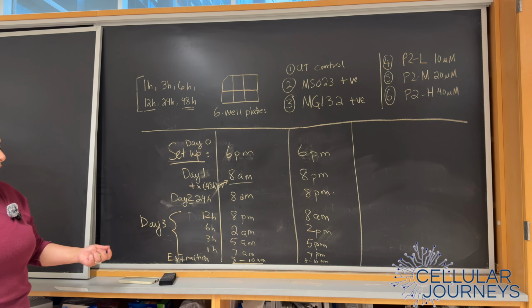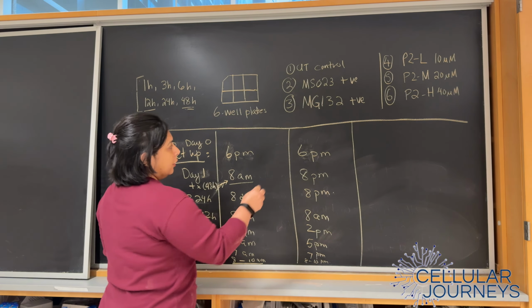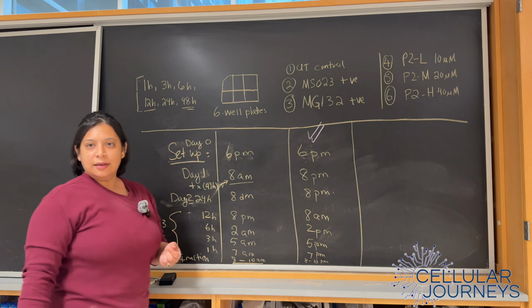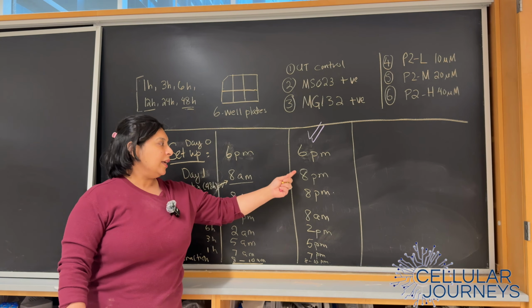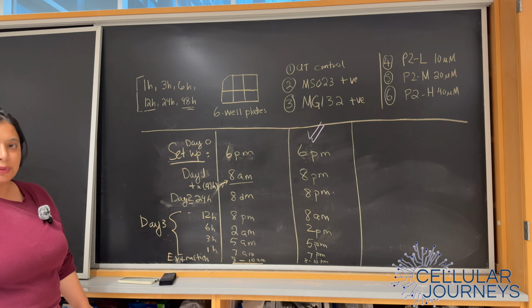So based off of this, you would want to look at this and say, okay, clearly we want to go with this pattern. So we want to set them up in the evening and do these first couple of timings in the evening so that we can have a manageable day.